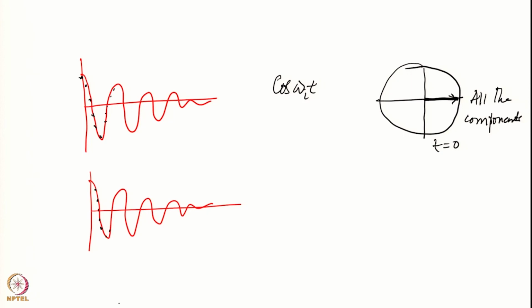So this can be a small time, a few hundred nanoseconds, that has nothing to do with the dwell time, it has some hardware limitations. So you may want to give a small delay here, we may call it T0. So your actual data collection starts from T0. So therefore your signal here will be cosine omega (t plus T0).